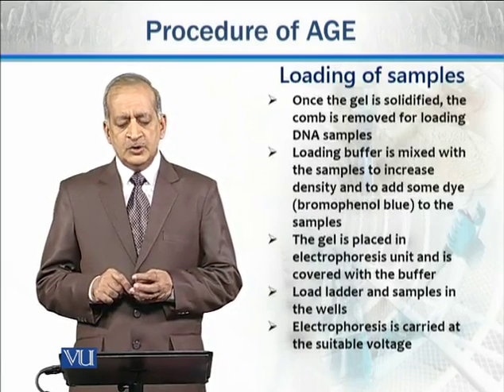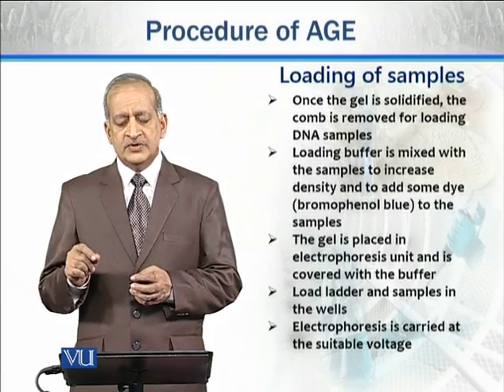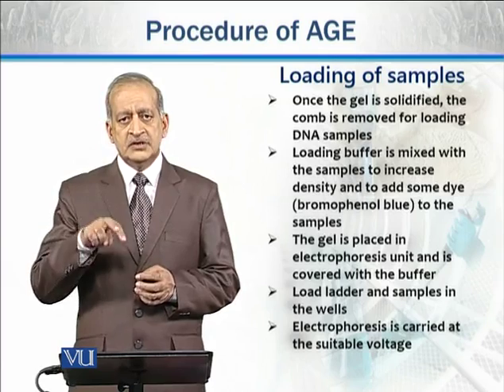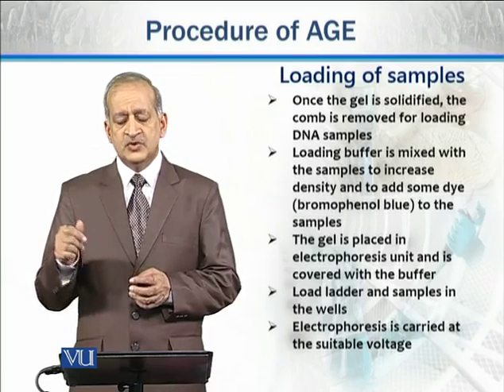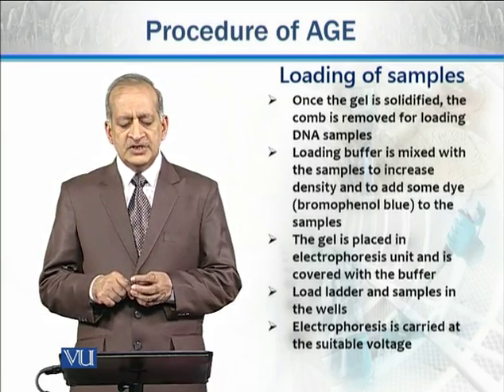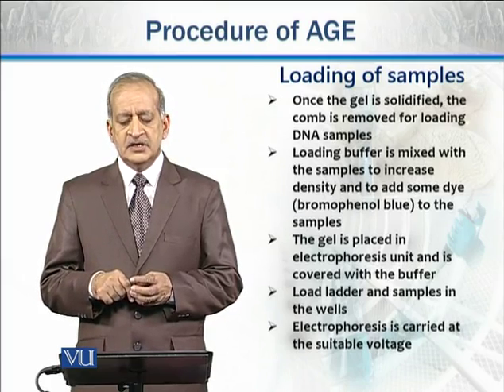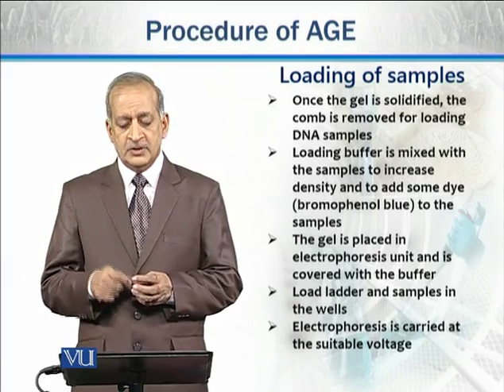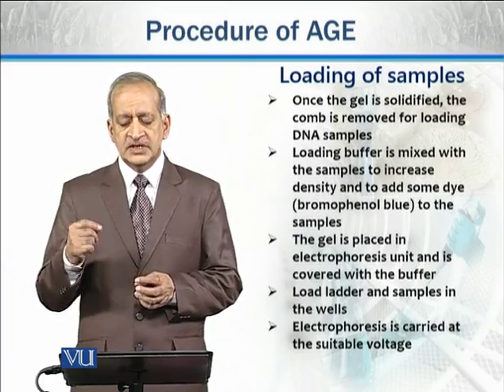Then how are samples loaded? Here, once the gel is solidified, the comb is removed for loading DNA samples. When we remove the comb, the wells are formed in the gel, and in these wells, samples are loaded with the help of micropipettes. Loading buffer is mixed with samples to increase density so that the samples are submerged at the bottom, and similarly some dye is also added, like bromophenol blue, which gives some color so that the bands or the moving DNA molecules can be seen.